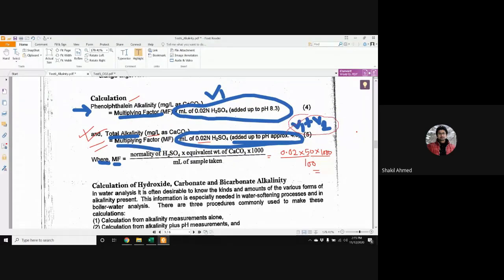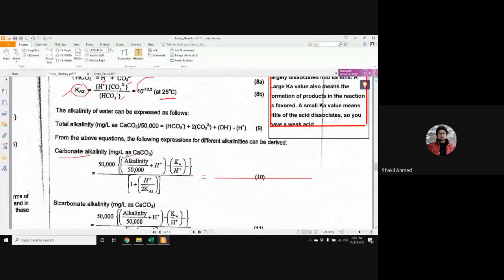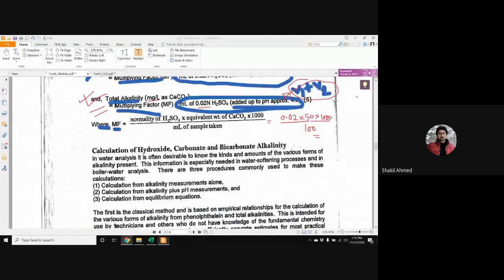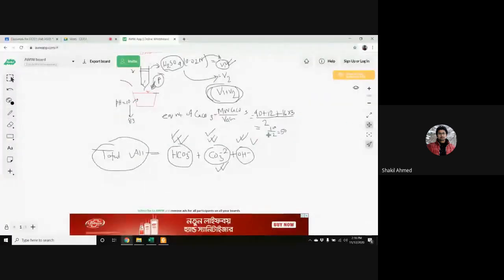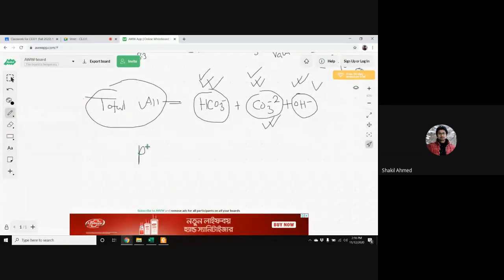So you know this. H plus. What is H plus? You measured pH, right? For example, pH is maybe 8.5 or maybe 8.6.